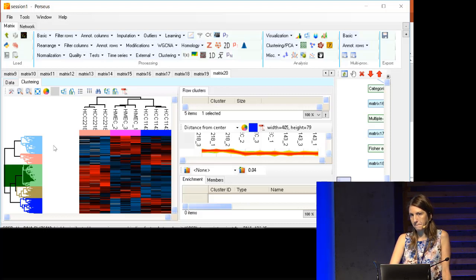I will come to you just. Hi. Is there a way to define the optimal number of clusters?